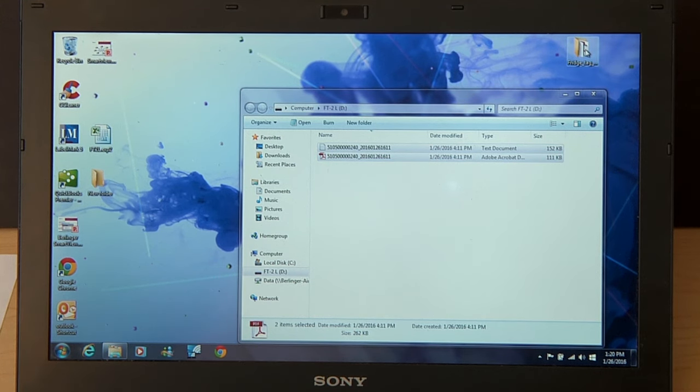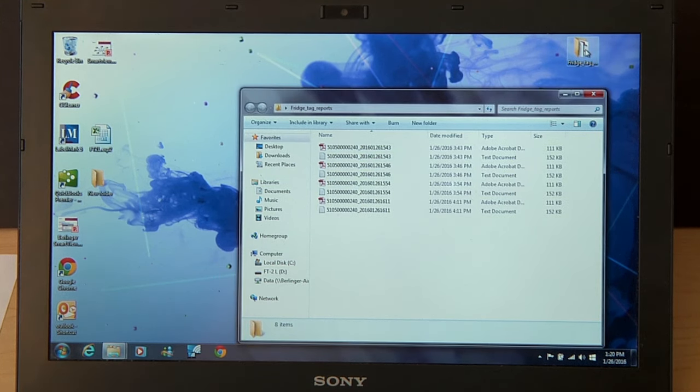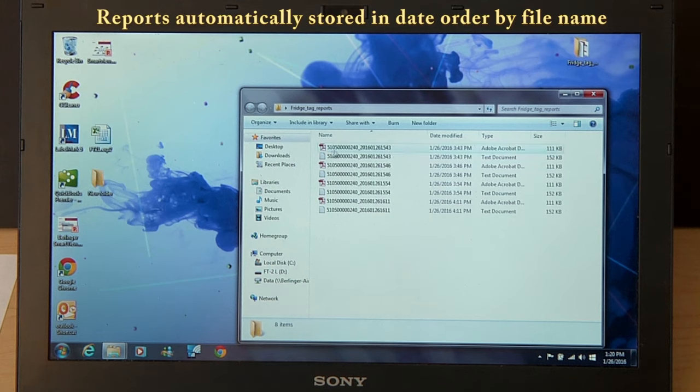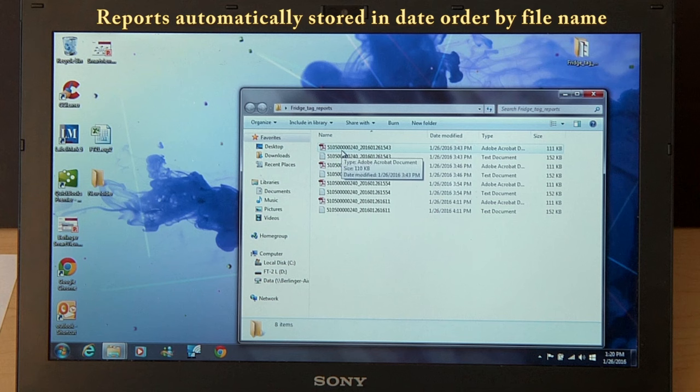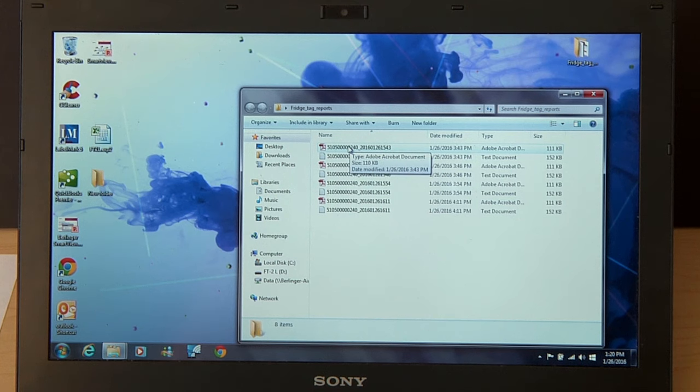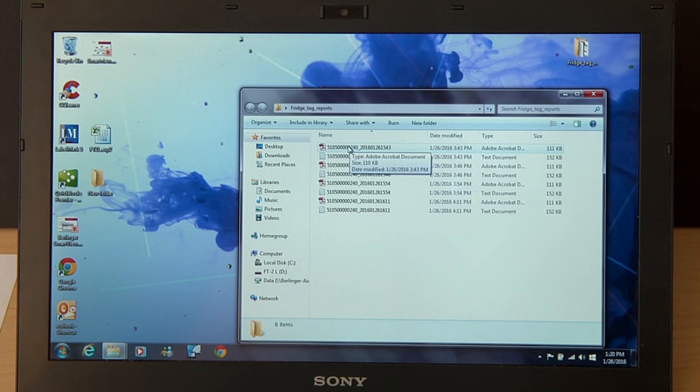If we open that folder, you'll see multiple reports stored by the automated file name, which includes the serial number of the Fridgetag 2 and the date and time that the report was generated, so that the top report in your file is always the most recent report. You must retain three years of reports to be CDC compliant.